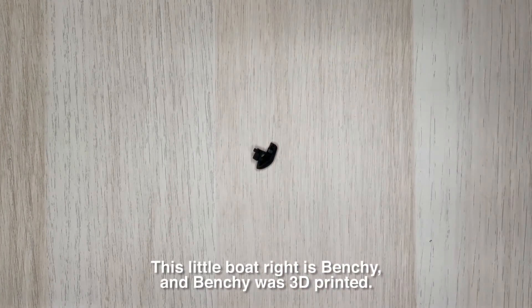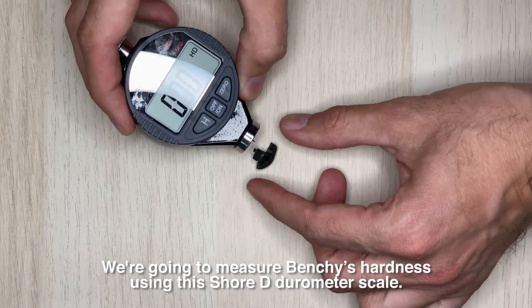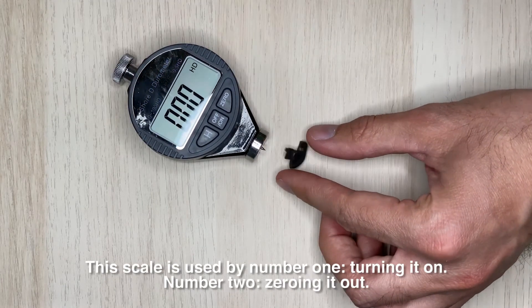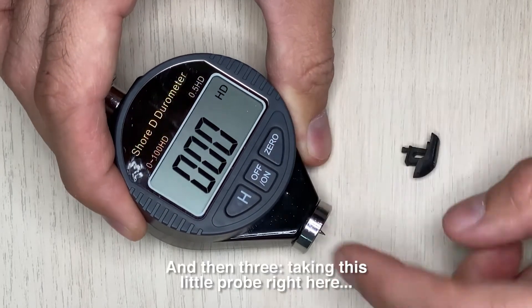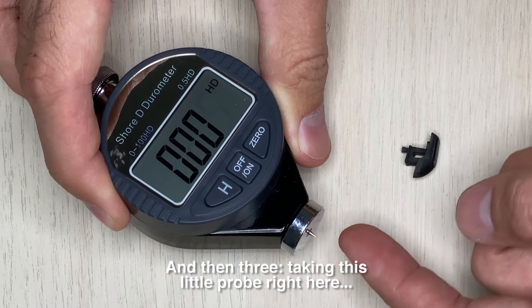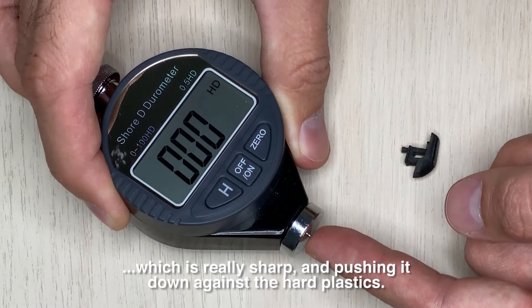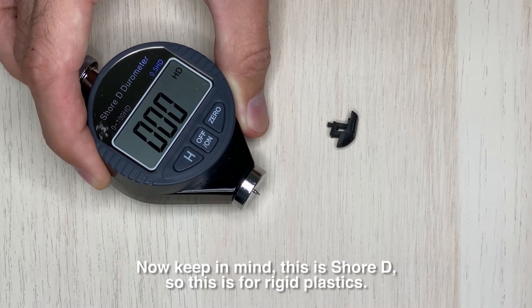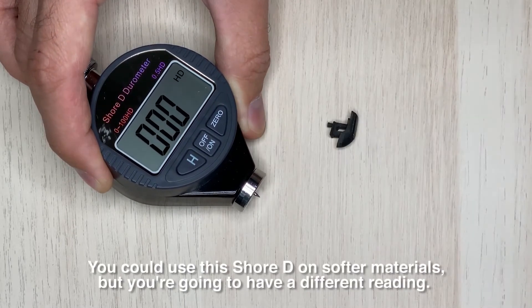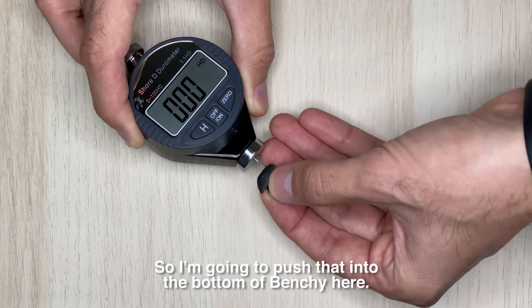This little boat right here is Benchy — a 3D printed model — and we're going to measure Benchy's hardness using the Shore D durometer. To use this scale: number one, turn it on; number two, zero it out; and number three, take the sharp probe and push it down against the hard plastic. Keep in mind this is Shore D, so it's for rigid plastics — using it on softer materials will give a different reading.